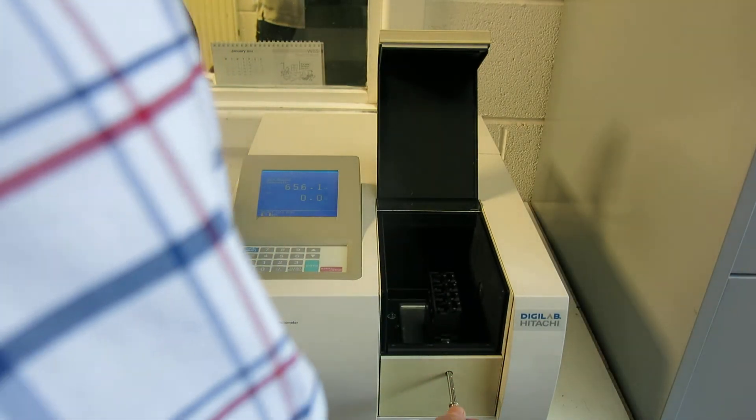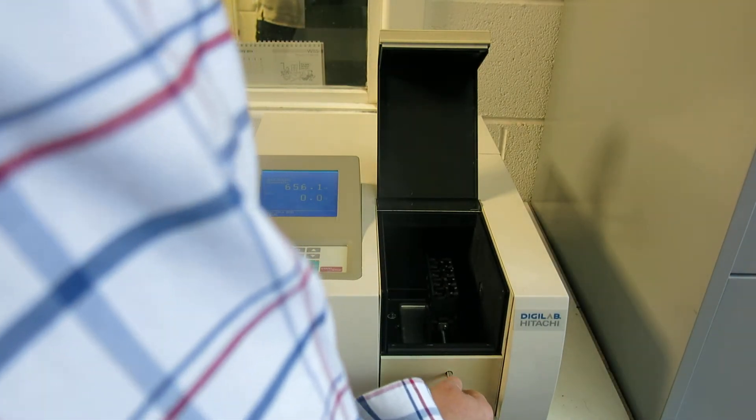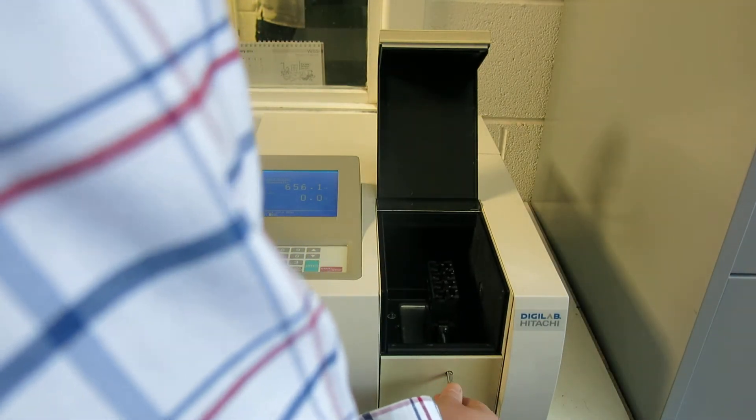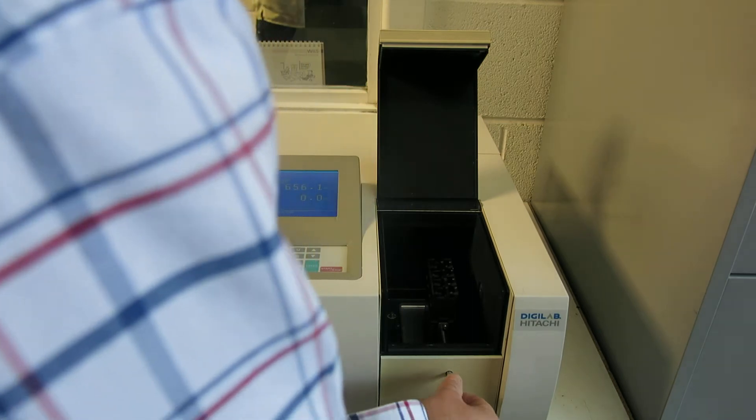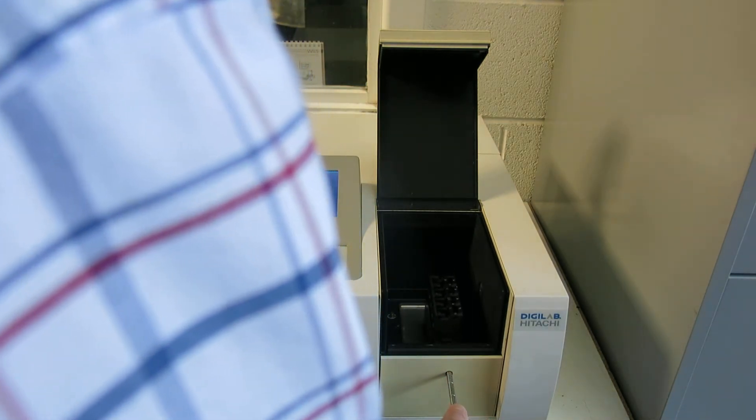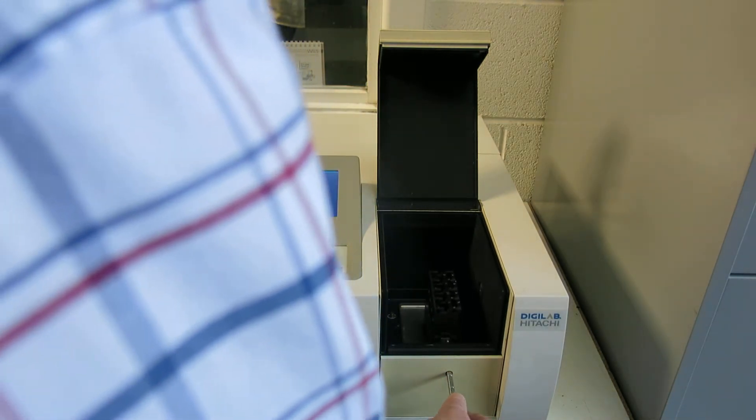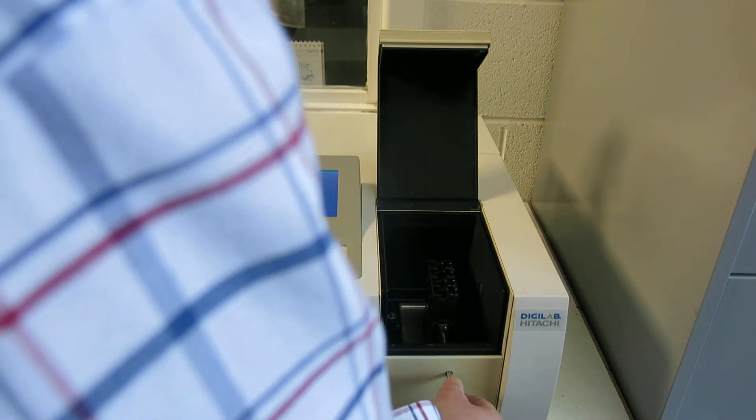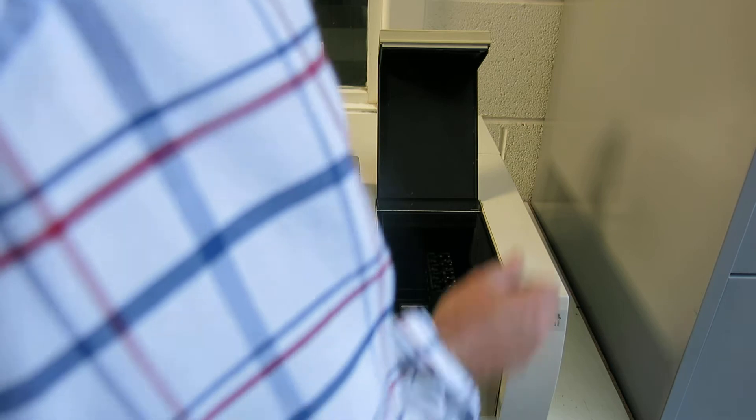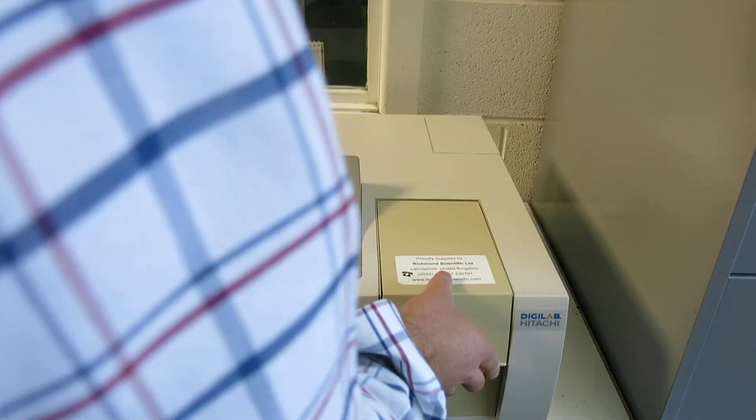This has got a multiple cuvette holder, which is pretty useful. An assortment of positions: position one, position two, position three, position four, etc. It's a multi-cuvette holder here.